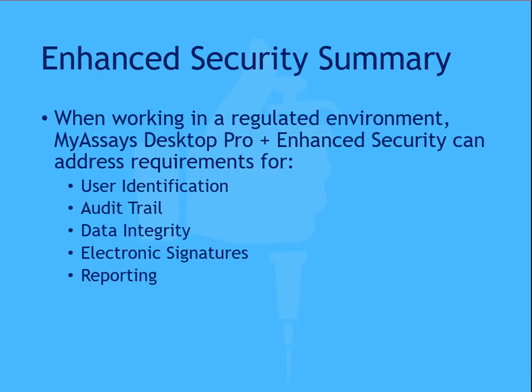Working in a regulated environment can present unique challenges for maintaining the integrity of your data and results. MyAssays Desktop Pro with enhanced security can address requirements specifically for user identification, provide a comprehensive audit trail, maintain data integrity, electronically approve and sign protocol and results files, and provide protected results. And in addition to these security features, the system has also been designed to provide tools enabling you to integrate secured processes seamlessly into your existing workflow.